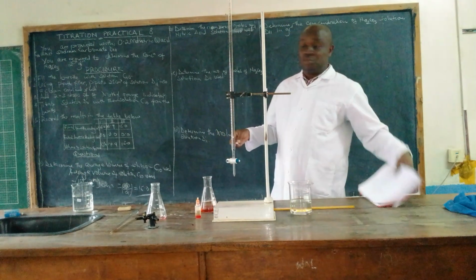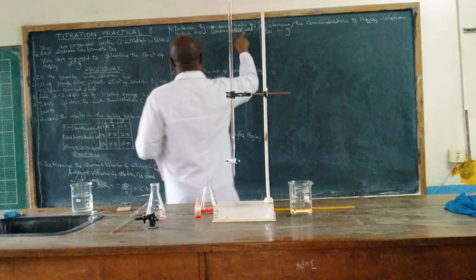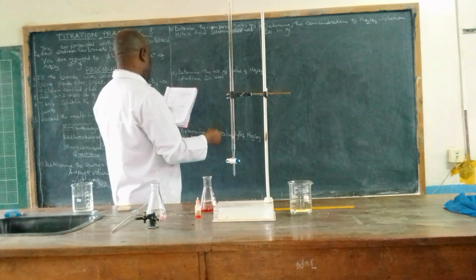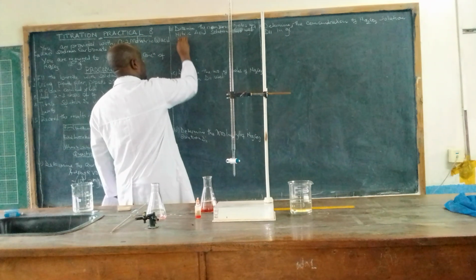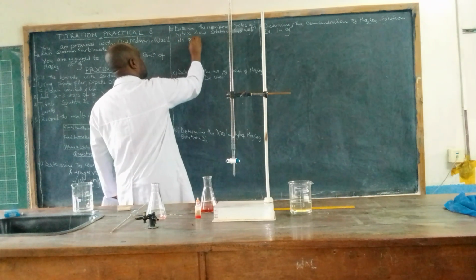We have been asked to determine the number of moles of nitric acid solution 10 used.